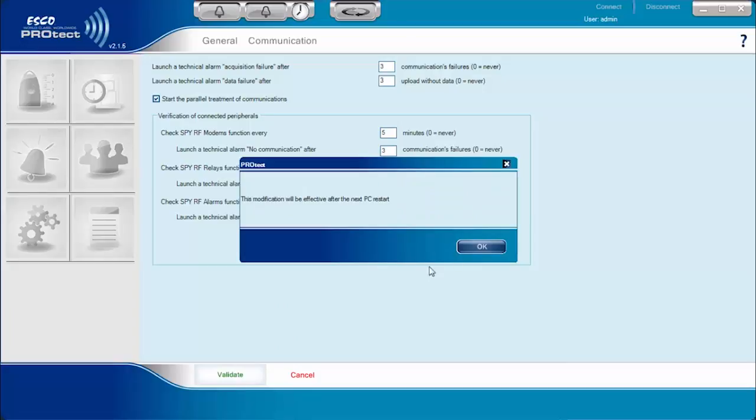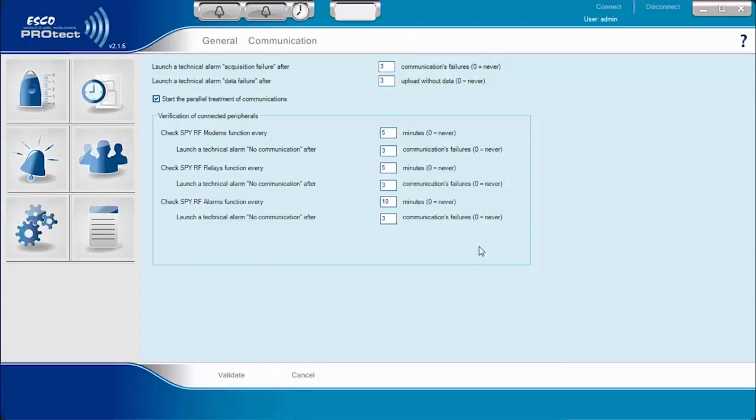Click Validate to save all changes in data. Thank you.